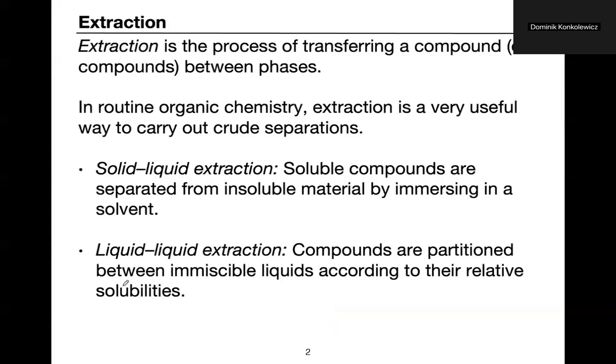Okay, so as we mentioned, extraction is a term we use for moving or transferring molecules or a compound between different phases. Okay, so these are different phases. Sometimes they're states of matter, and sometimes they're the same state of matter, but two different versions of it. We'll see examples of both. Okay. So in organic chemistry, extraction is commonly used to purify and to separate.